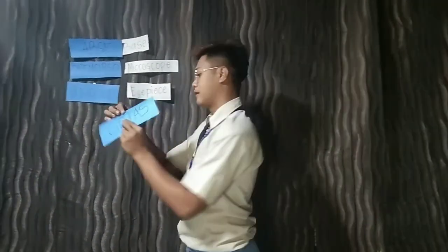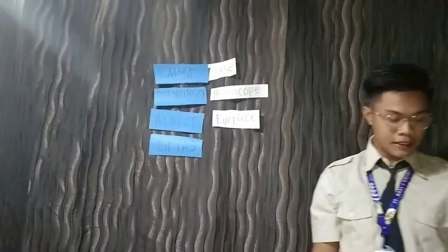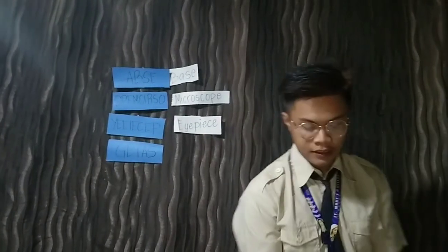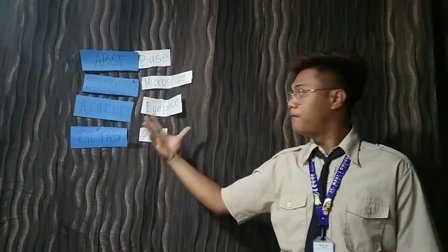And the fourth word is, what is this? What word is it? Okay, it is the stage. Very good. Okay, these 4 words are related to our topic today. But before we proceed to our topic today, I will show you my objectives.